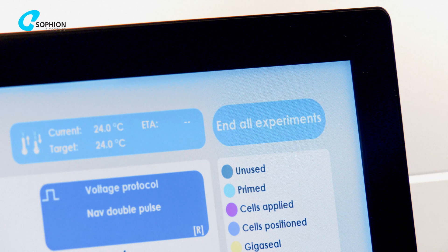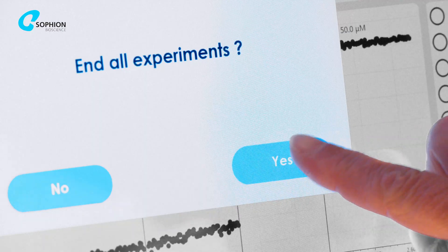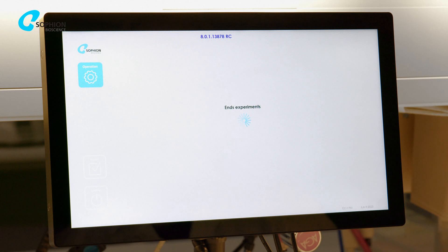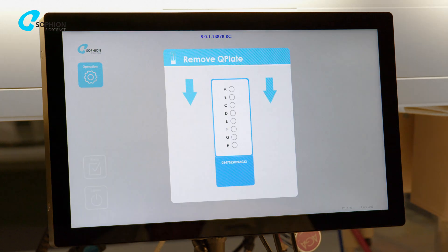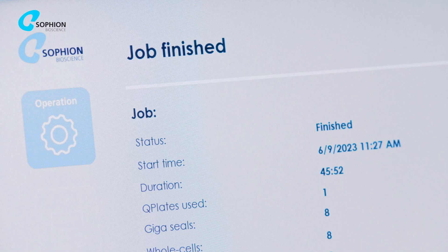To terminate the recordings, press the End all experiments button. The data from all recording sites is automatically saved to the onboard database.